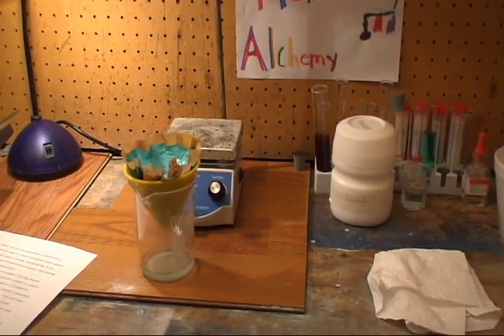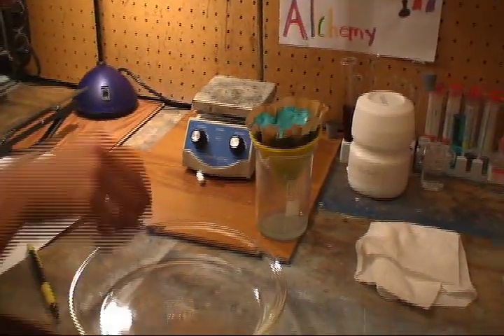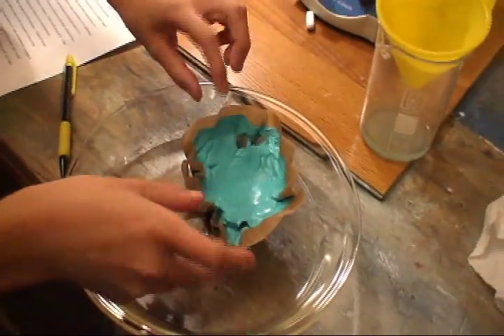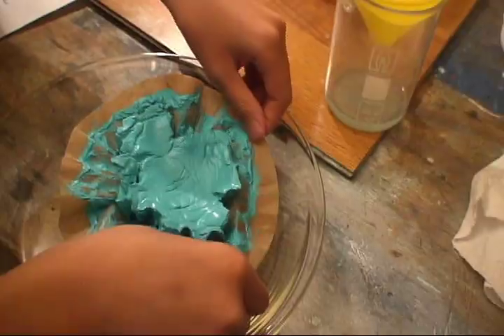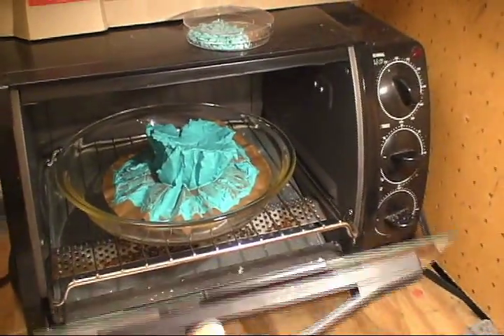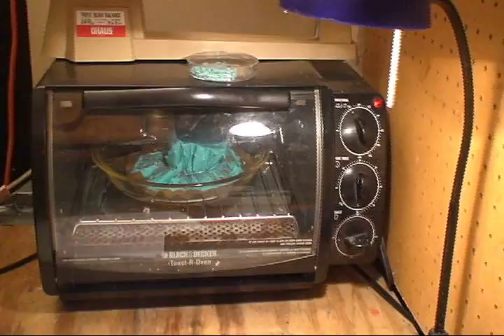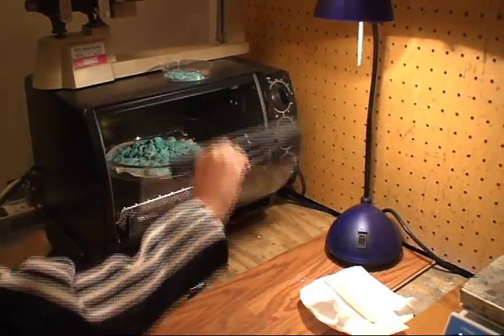Now we have filtered all the water from our copper carbonate. We're going to put it in the oven to get rid of the excess water and dry it for a couple of hours until it's fully dried. Here is our final product — copper carbonate.